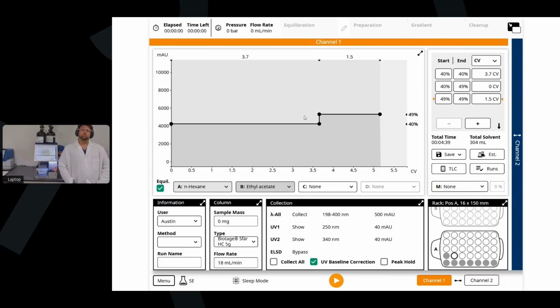Sure. So slurry loading is probably not your best option. I would definitely recommend dry loading, like I spoke about earlier. This helps again to minimize the solvent effects of your sample. Like I mentioned before, utilizing those duo columns allows you to do slurry loading, or allows you to do other loading options. For dry loading, again, we're mixing our compound with the silica or the media that we're trying to absorb our compound on, removing that solvent, and either loading that directly on top of the column frit, or utilizing the samplet and or DLV to perform that dry loading.